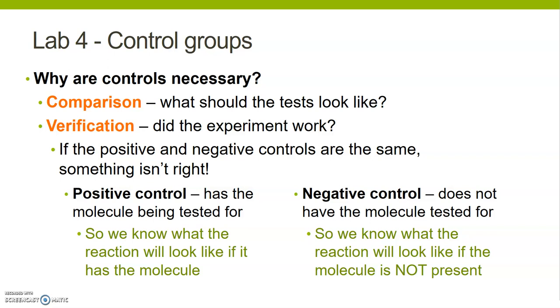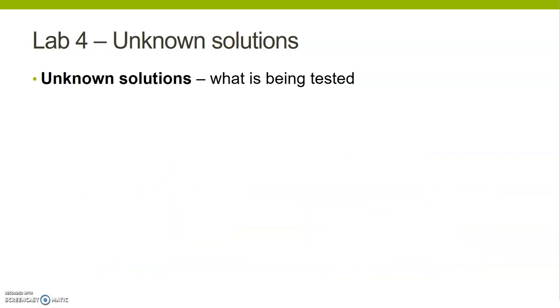But water is not always the negative control. So don't get it in your head that water is the negative control for everything. It's not, right? It really depends on what the experiment is. Later in the semester, we'll actually use a control that is alcohol-based and not water-based because of the experiment. So the controls depend on the experiment that we're running. In this case, because we are looking at biological molecules, our positive control will have the biological molecule, our negative control will not.